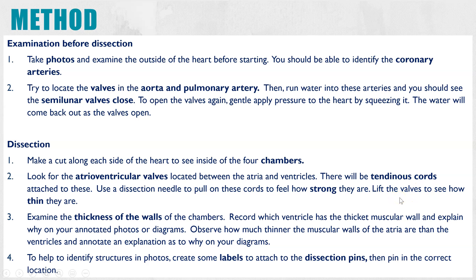Next, examine the thickness of the muscular walls of the different chambers. Key things to note are the thickness of the left ventricle muscular wall in comparison to the right, and annotate any photos to explain why the left ventricle has a thicker wall. Also compare the thickness of the atria walls versus the ventricles and annotate why. If you want to know the reasons, I'll link my video on heart structure and function.